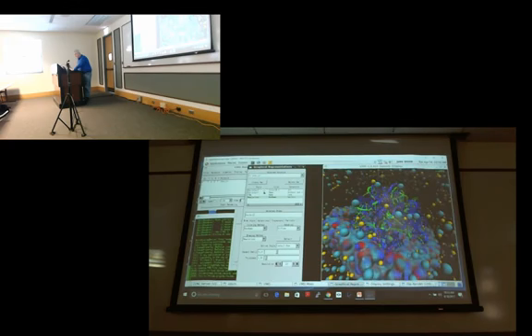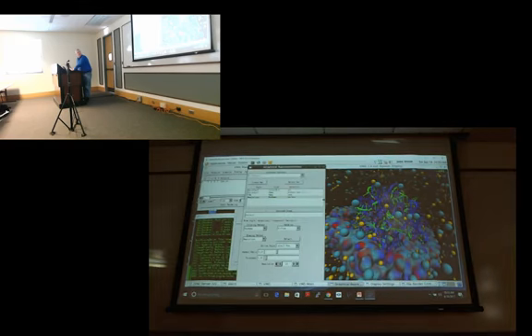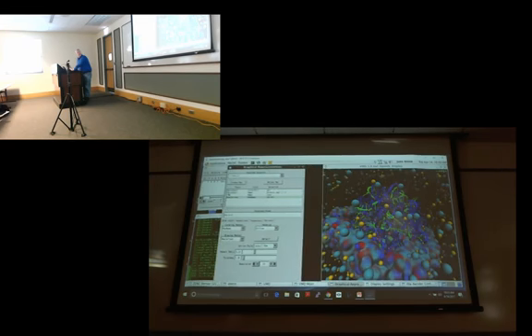So you can see now in this menu, I've got on the left-hand column, various representations are shown, and you can see how they were colored either by color ID, which is manually selected color, by the atom name, by residue name, and then you can see there at the edge the atom selection text that's used for each of those representations. Cool thing that you can do in VMD is you can toggle these on and off.